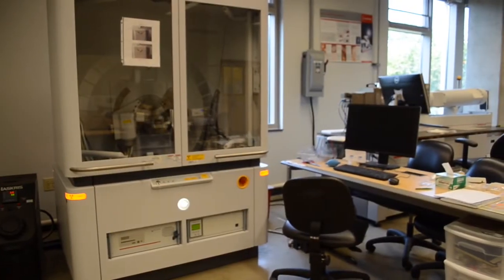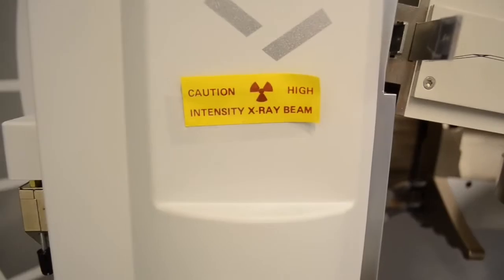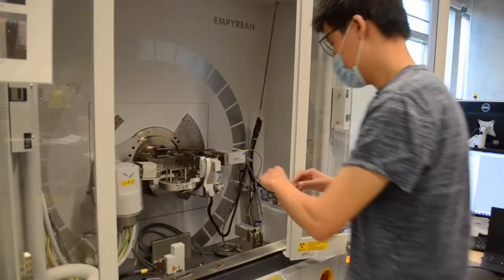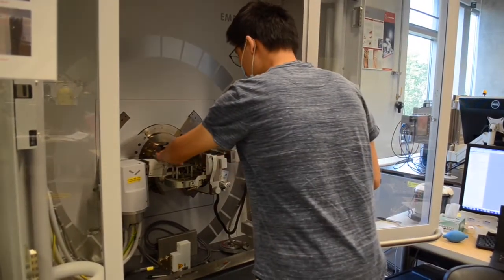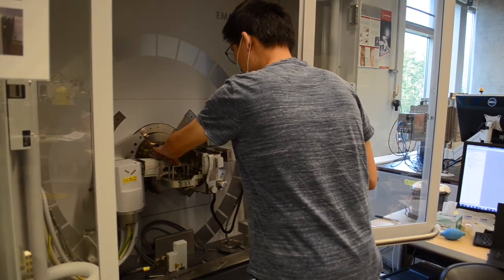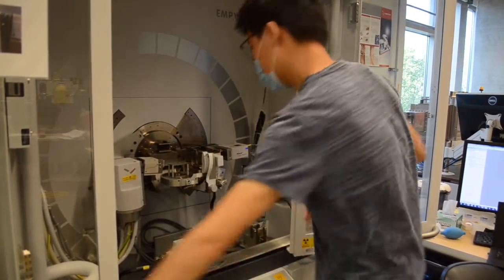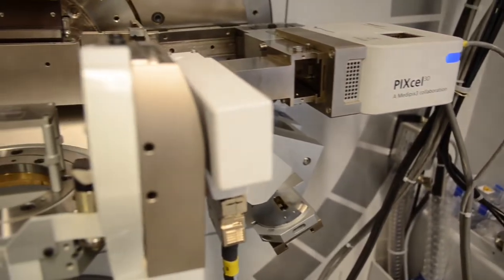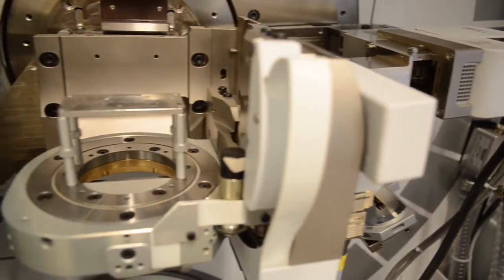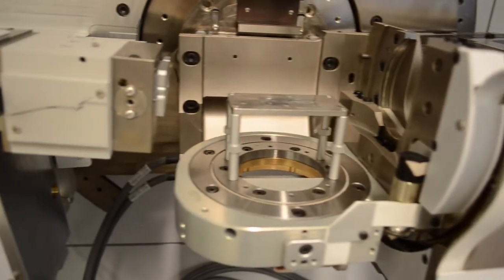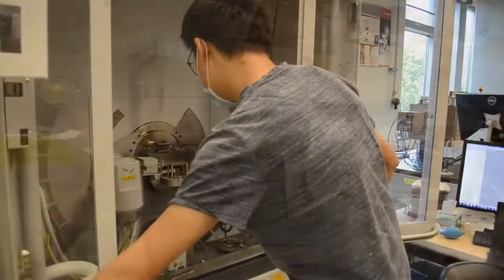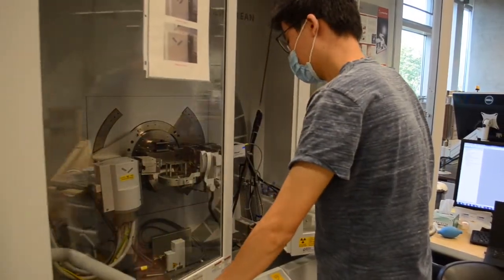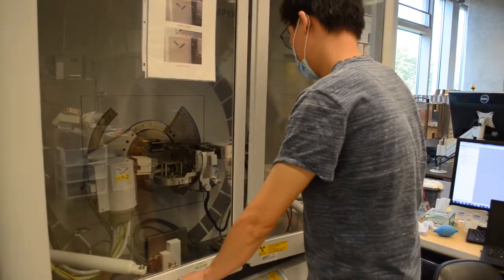Our Panalytical Empyrean XRD is a multi-purpose X-ray diffractometer with a lot of new technology, which provides a platform for high-quality structural analysis. It is equipped with a PIXcel 3D detector, which is a solid-state hybrid detector with the unique ability to measure all sample types on a single instrument, from powders to thin films, from nanomaterials to solid objects.